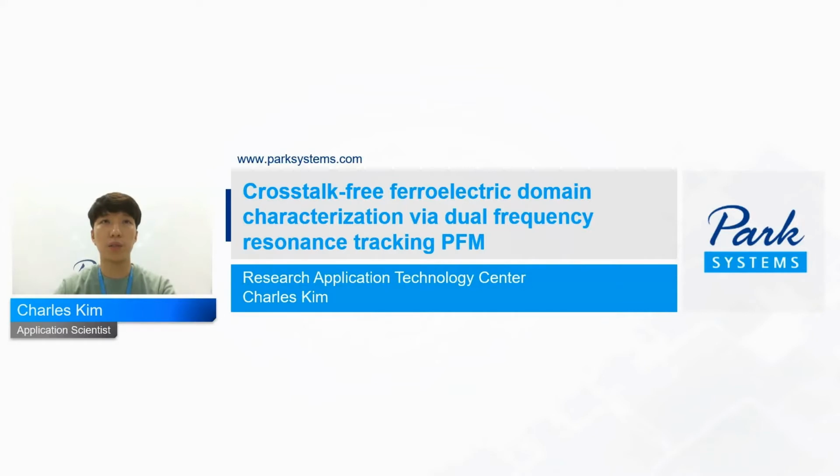Today's live talk title is Crosstalk-free Ferroelectric domain characterization via dual frequency resonance tracking PFM. And at the end of this webinar, I will introduce our new AFM, the FX40, and then to help you understand the PFM measurement, we'll prepare a live session using that AFM system.